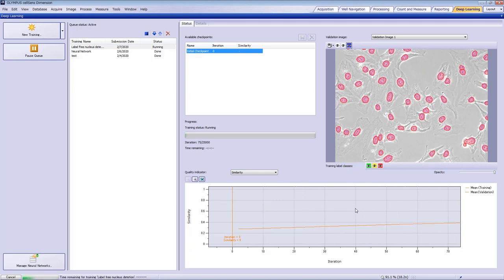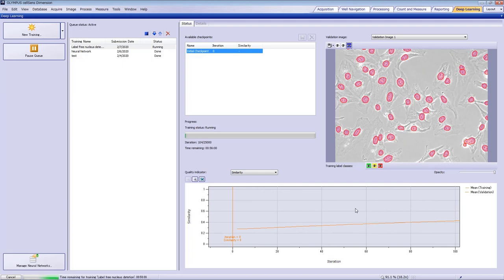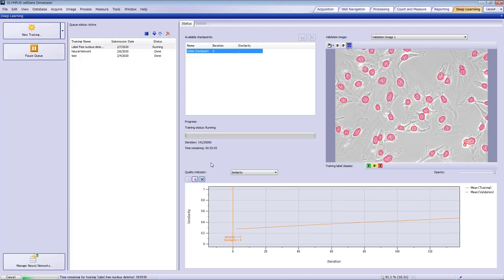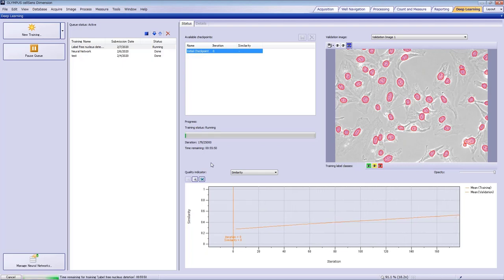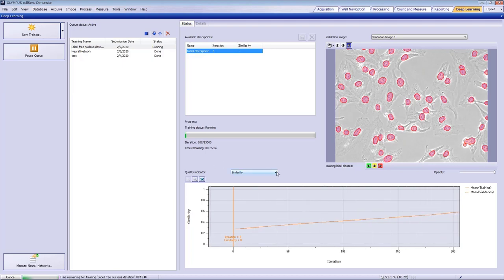There are several ways to check accuracy. The similarity between the training layer and the layers where the neural network identified the nuclei, called inferred layers, is shown by default. The minimum value is zero, and the max is one. Note that the similarity increases during the training process.